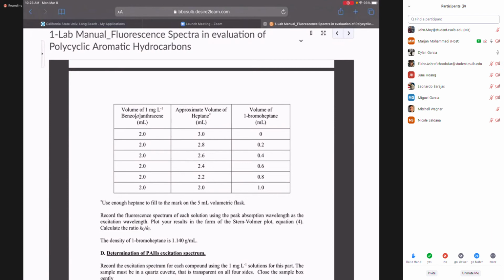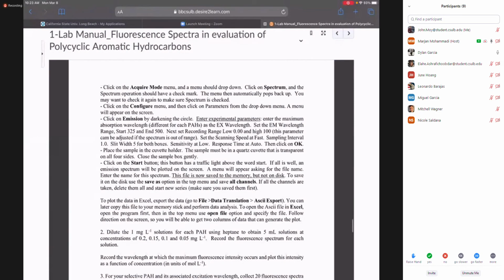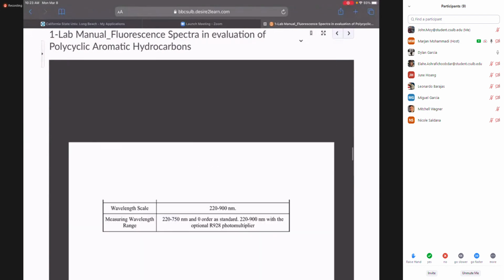This can be seen very obviously in one graph, so please give me an overlay of the quencher data so we can easily see how the intensity gets less and less. Then you are going to use that data in the quencher formula. Let me scroll up.